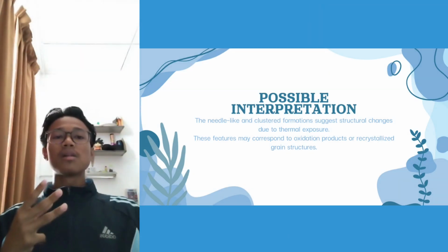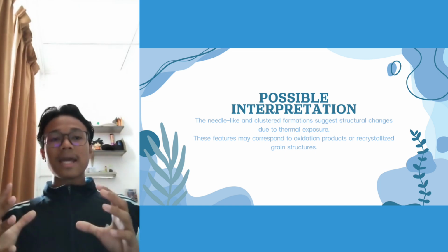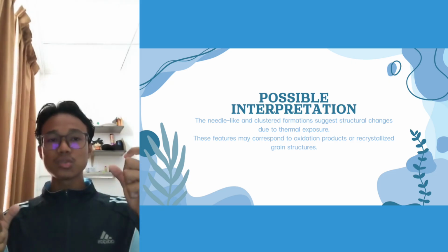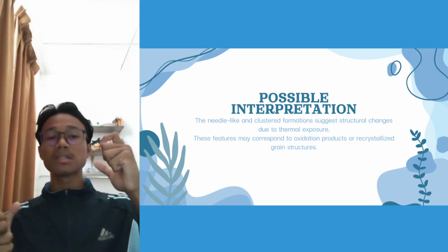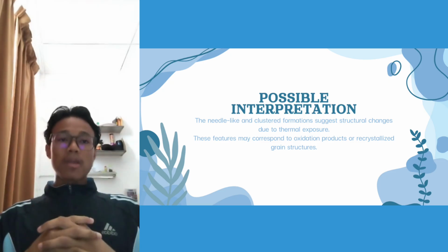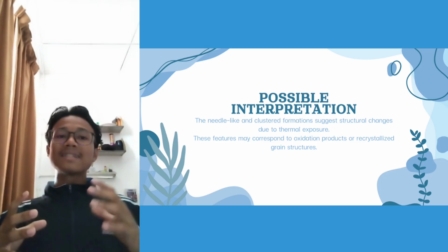And the third point, the possible interpretation. The needle-like and cluster formation suggests structural change due to thermal exposure. This feature may correspond to oxidation products or recrystallized grain structures.